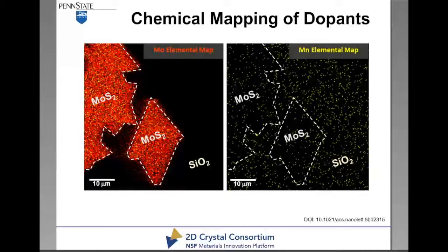Now, if you're just going to look at a plan view, you can take the whole film off the substrate and put it on the TEM grid, and you don't need FIB for that. But quite often when you're going to do cross-section of these materials, that's when you start to need FIB. It's the same as what happened when we did the different orientations of the tungsten telluride, where we wanted to make sure we had the proper orientation to look at it.